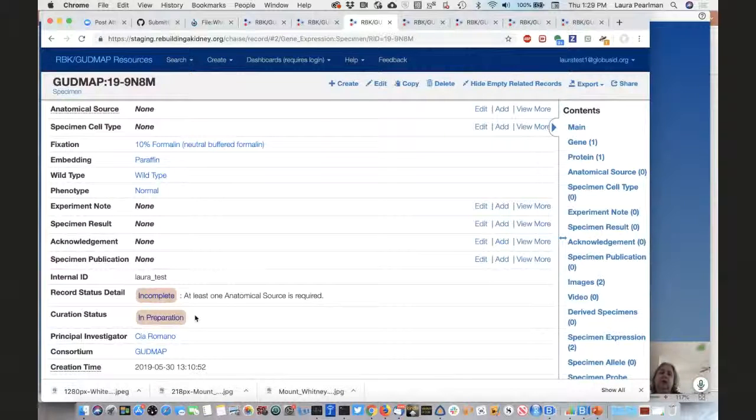For specimen data, it gets dispatched to our biocurator. So you'll fill out submitted, it'll go into biocurator review. It's still not visible to anonymous users. It will only be visible to them when it's released. And so our biocurator will either release it so that everyone can see it, or he'll get back to you and ask you some questions and see if there's anything that needs to be refined or added in.